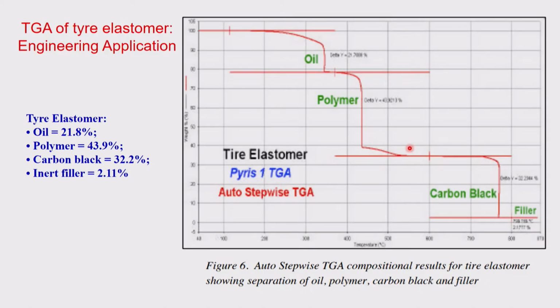Okay, you've seen the tires which we use for all our automobiles and for everything, etc. So if you take a small piece of that and heat it, it starts with 100% and will go down to almost close to 5% or something, close to 0. So what are all the materials? There is one major drop, another very major drop of the weight, and then another.